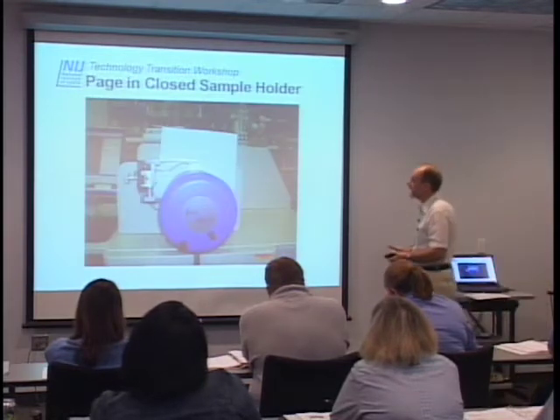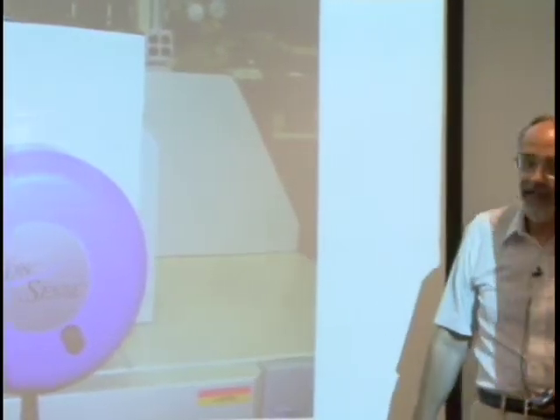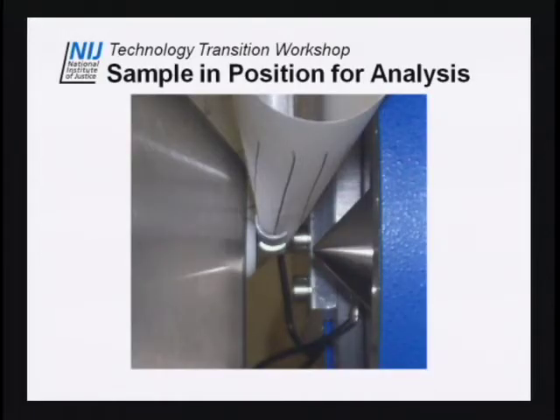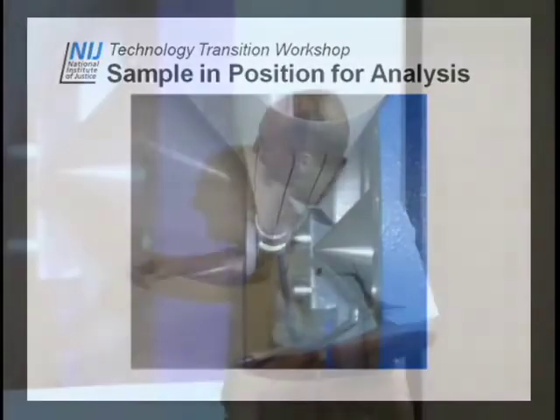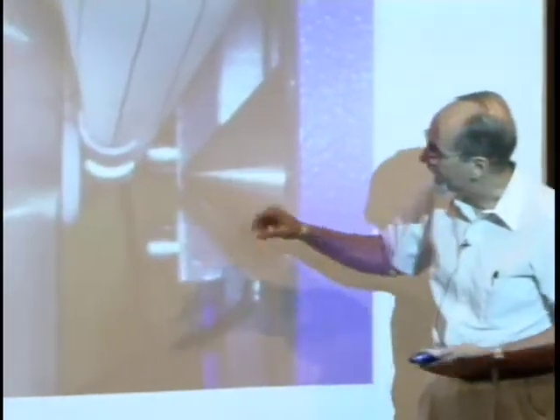Here it is once you've flipped it over at the hinge, now down in place. You'd have trouble getting it in there if the hinge wasn't like that. Looking from the side, you can see the white nozzle and cone of acceptance, and here's the hook with that eighth-inch wide slot. So it's simply held in there in that line — you don't have to have steady hands or waggle it just the right way.